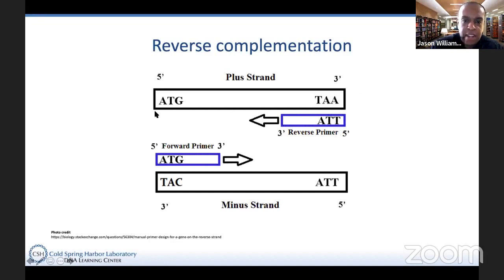But in sequencing in 2 directions, I'm going to see if I'm smart enough here. I don't want to do this on the whiteboard. I was going to think about annotating, but it won't add very much. What you do by also getting bidirectional sequencing is increase your probability of getting good sequence at the 5' end and also at the 3' end. So we sequence twice, and that in itself is a control.